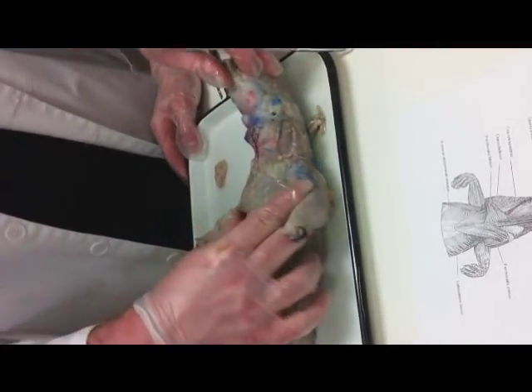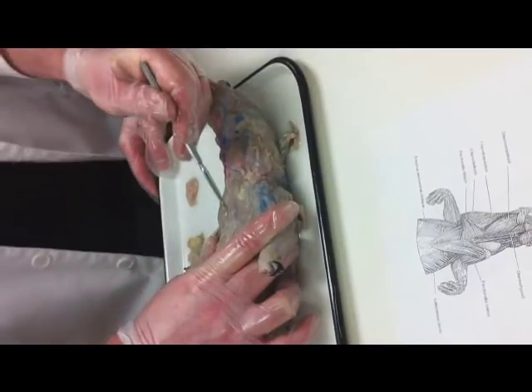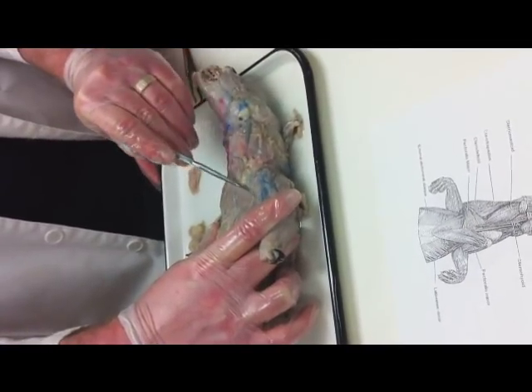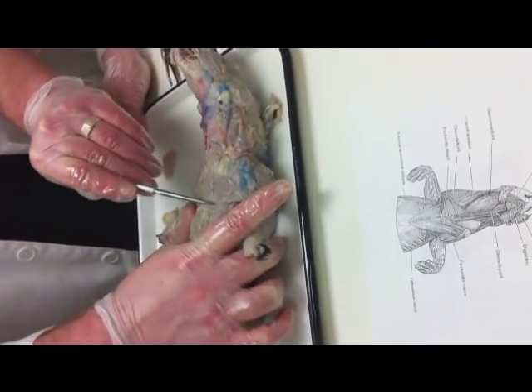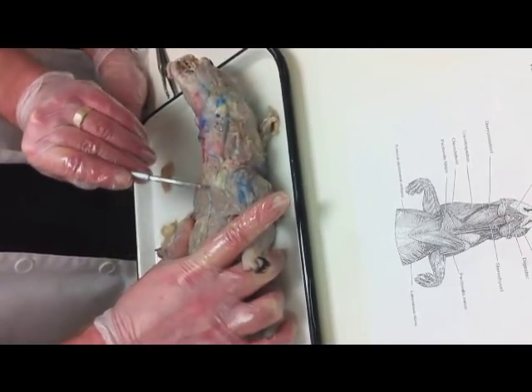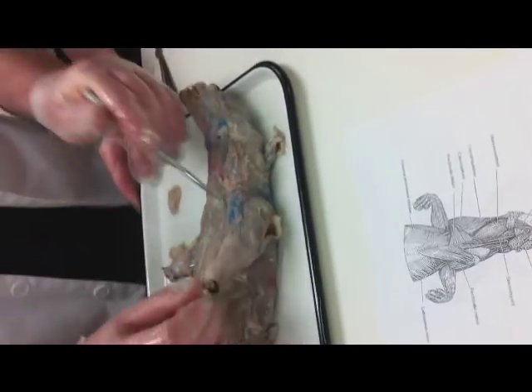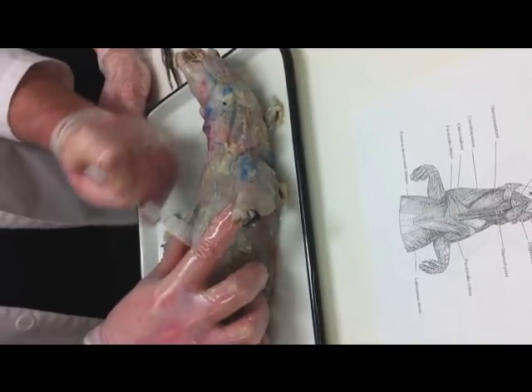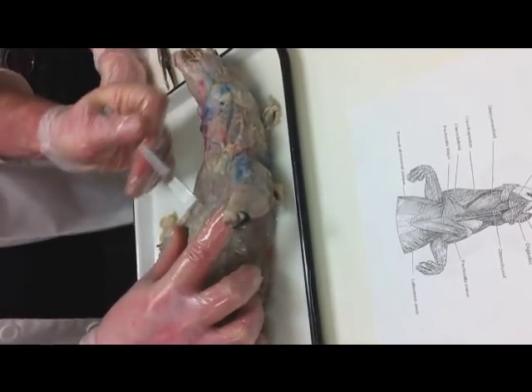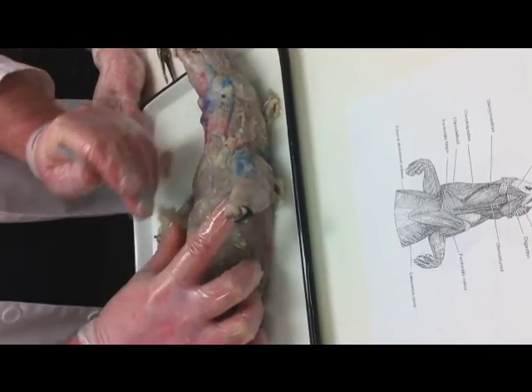Now I'm going to roll him over, and what I'll notice is that he has pectoral muscles, and he's got two sets. One that starts from the center and goes out in a triangular shape. Can you see that? Okay, right there. Those are his pectoralis majors, pec muscles. These ones here run down and underneath. You can see the striations in the muscle are running this way. See that? As opposed to the striations in the muscle running this way. These are his pectoralis minor.